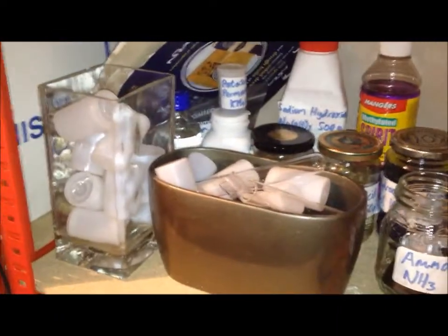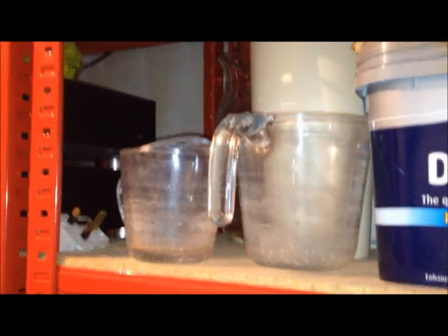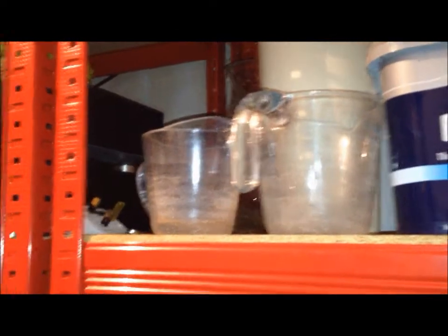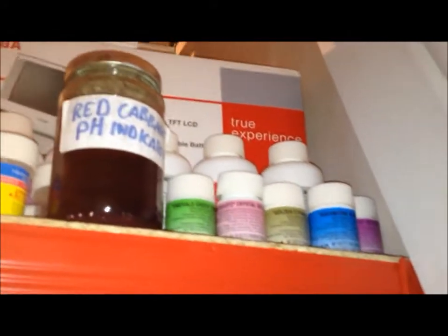My big box of film canisters and my test tubes are in there as well. Up here on the second shelf I've got some water containers which I don't use very often. On the top shelf are all my indicators and my crystal making kit, so I've got lots of different colours of aluminium, potassium sulphate and stuff like that, and I've got some pH indicator there.